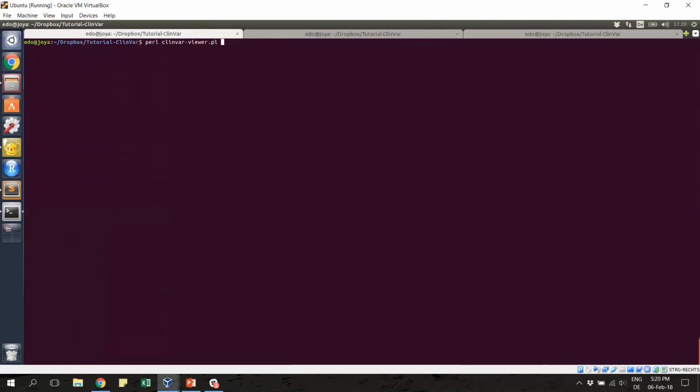So this time, we have the option 3 now. We have annotate, and then you put the name of the file, which in this case is frequency of genomic variants. So you just press enter. It's currently performing and searching each of the variants in ClinVar for whether they have some frequency reported in control populations, such as the gnomAD database.